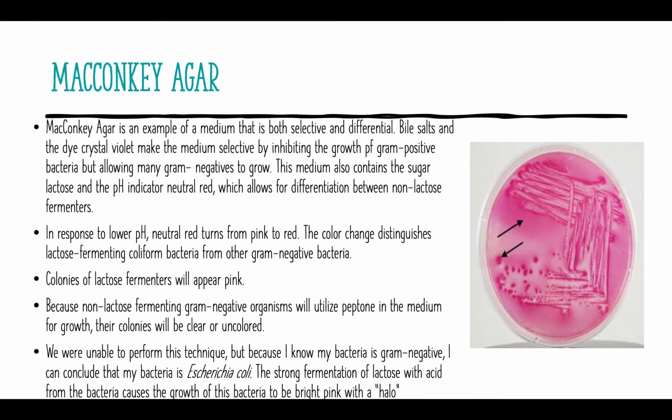I was able to conclude that my bacteria is Escherichia coli, E. coli. The strong fermentation of lactose with acid from the bacteria causes the growth of bacteria to be bright pink with a halo.